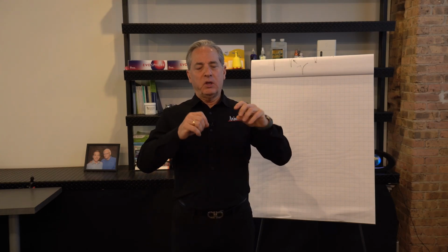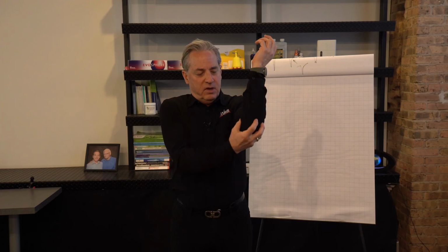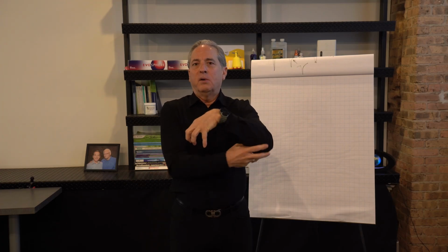If you bond a C18 onto a column, we have a normal silica, SiO, SiO, SiO silica. We put a C18 here, C18 here. Generally speaking, we can't put one in between. There's no room there. So if you do C18 chemistry, the traditional approach, you only bond half the silanols. If you can figure out how to improve that, if you can figure out how to go to those silanols in between, bidentate, where it grabs here and it grabs there, or lots of t-butyl groups in the middle, there are ways to put more carbon on the column other than just surface area.